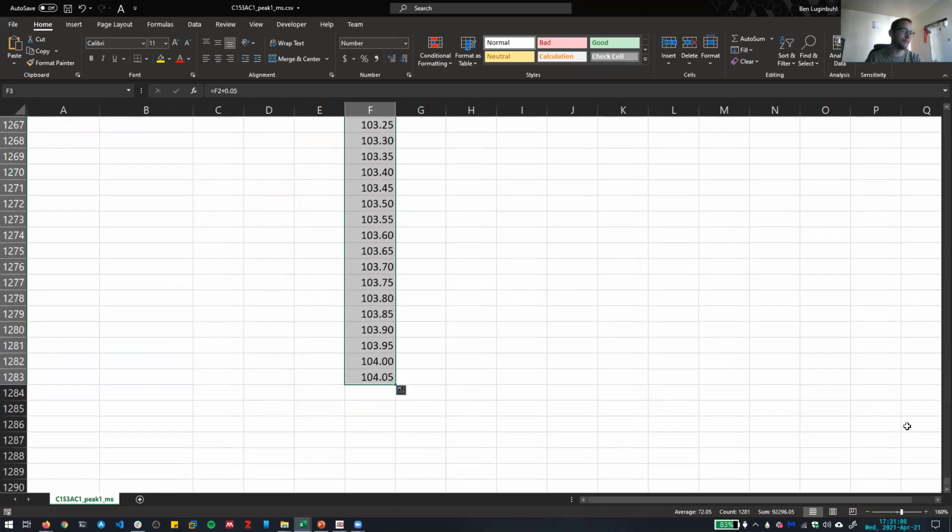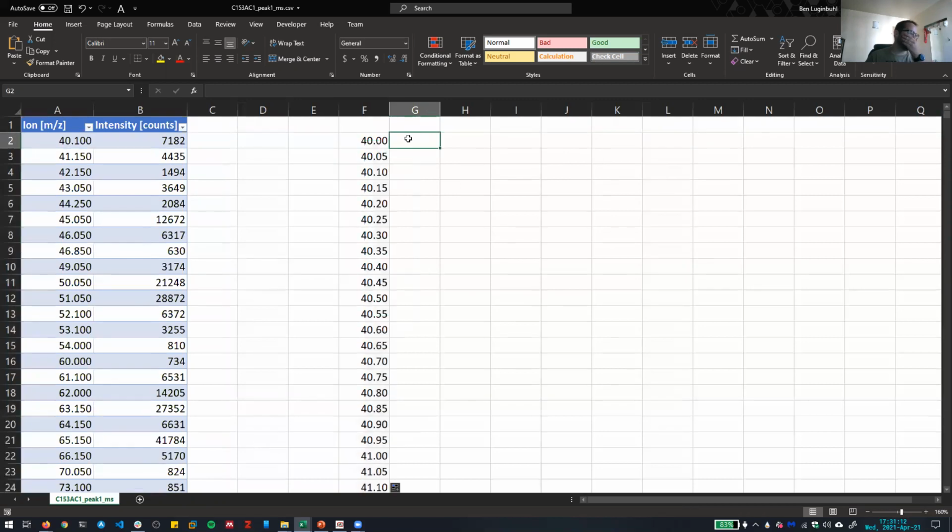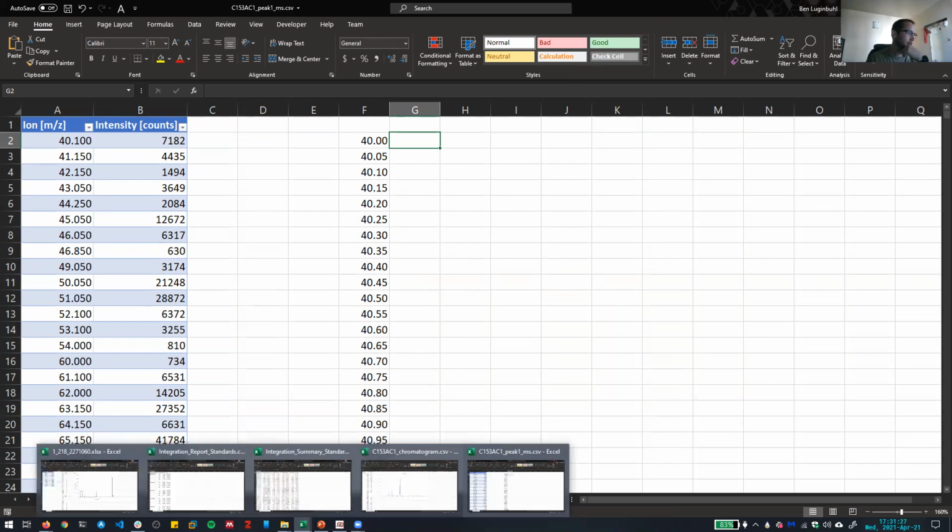Okay, that's plenty. So the next thing we want to do is fill in this column here with the counts from this column here. And the nice thing about Excel is it has some cool built-in functions that we can use. Let me open up my reference here real quick. Not that one. One second.